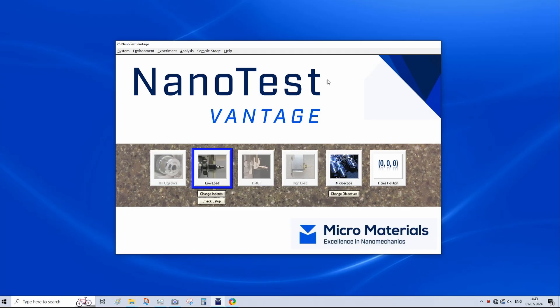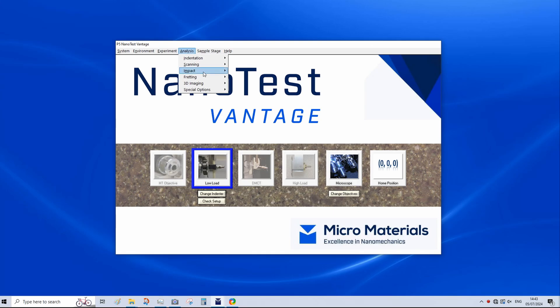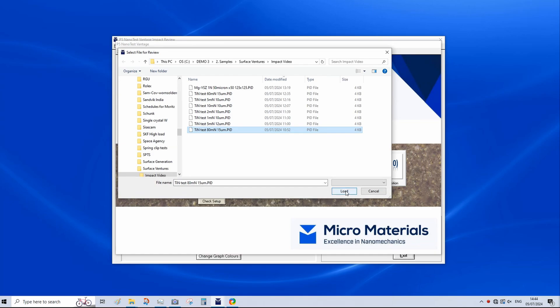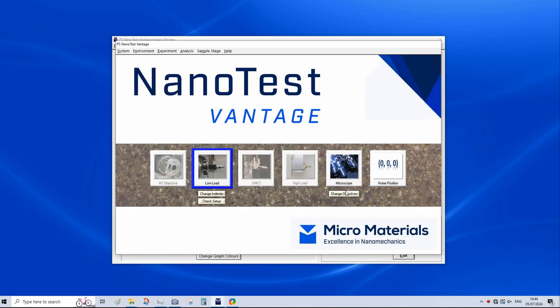So we've now finished our nano impact test on our titanium nitride coated silicon. And we're going to analyze the data. So to do this, we go to analysis, impact, review data file. Select the relevant one, in which case it was our 80 millinewton load with 15 micron retraction distance.